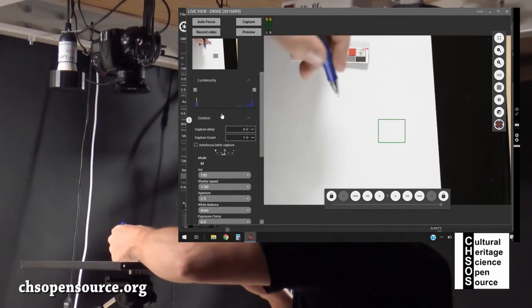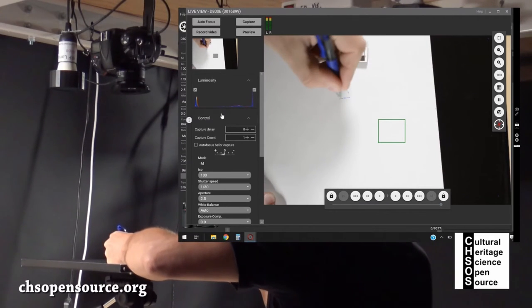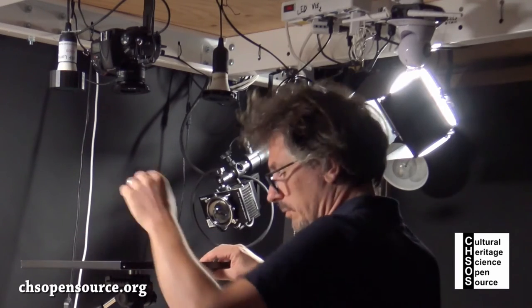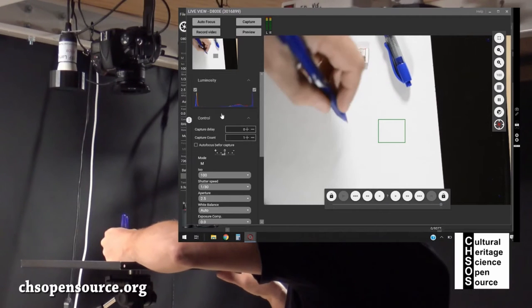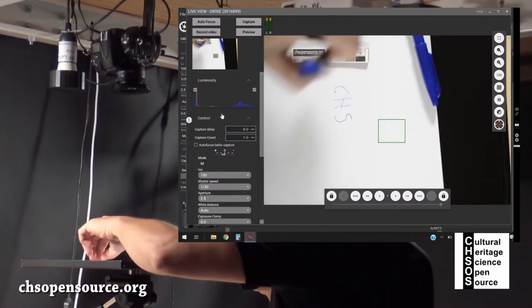We will write CHSOS using the two different blue pens. First we use the standard pen for writing C and H. Now we add the letter S using the erasable pen. And we complete O and S using the standard ink pen.